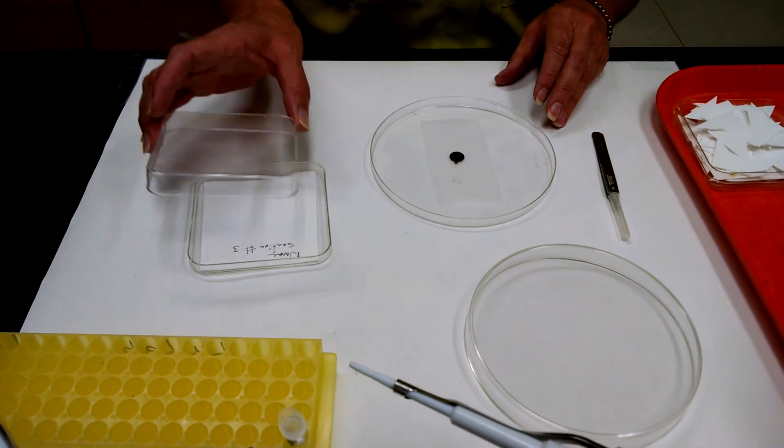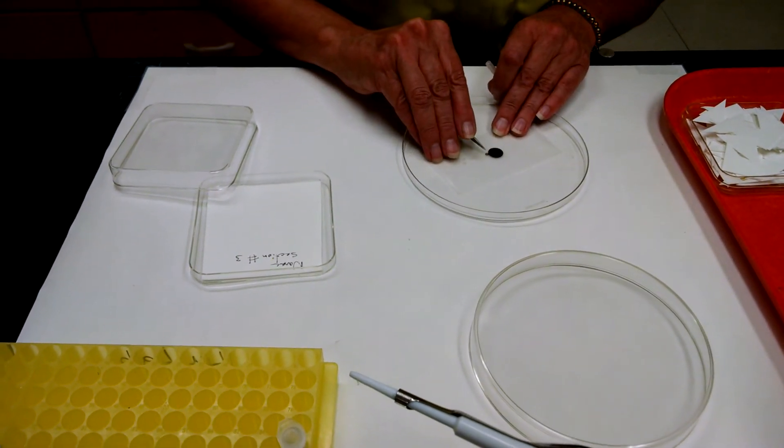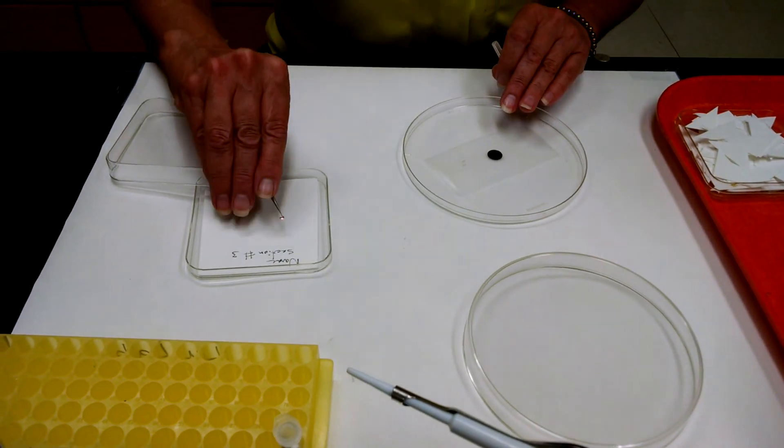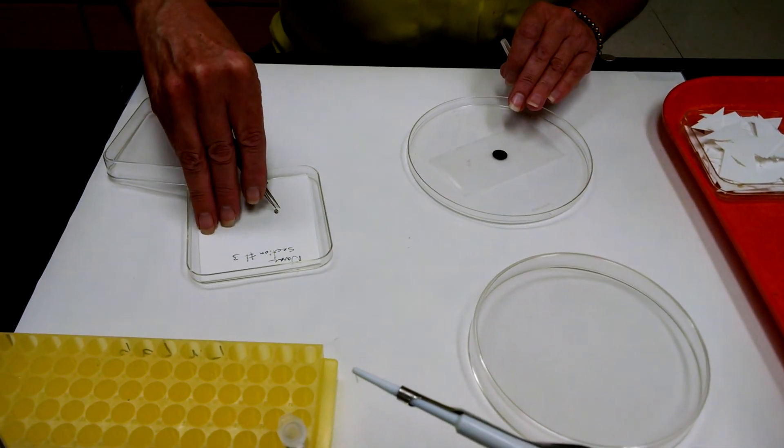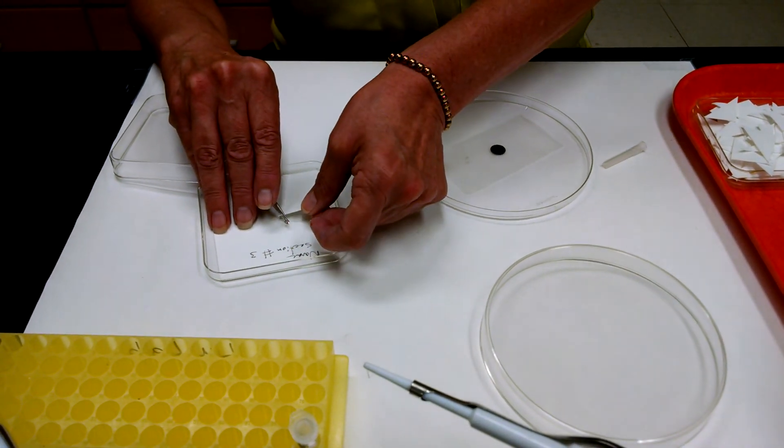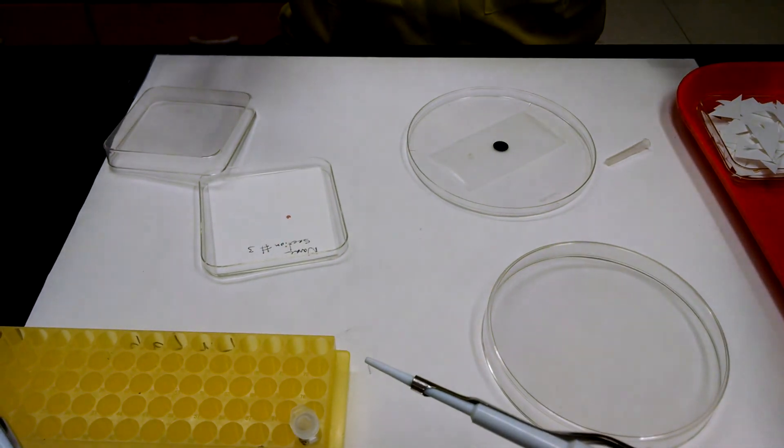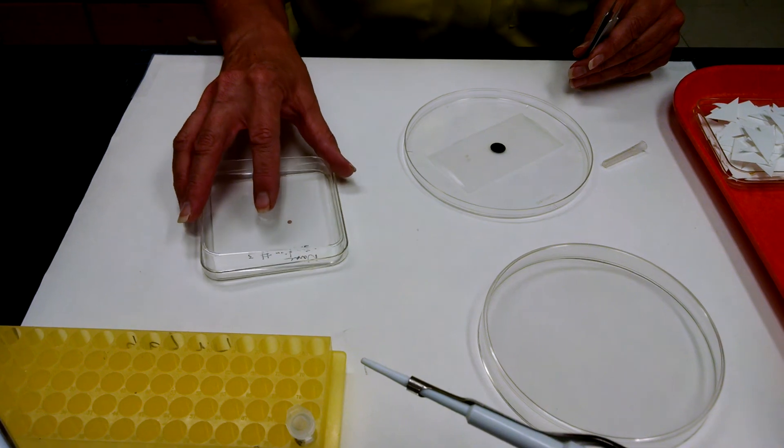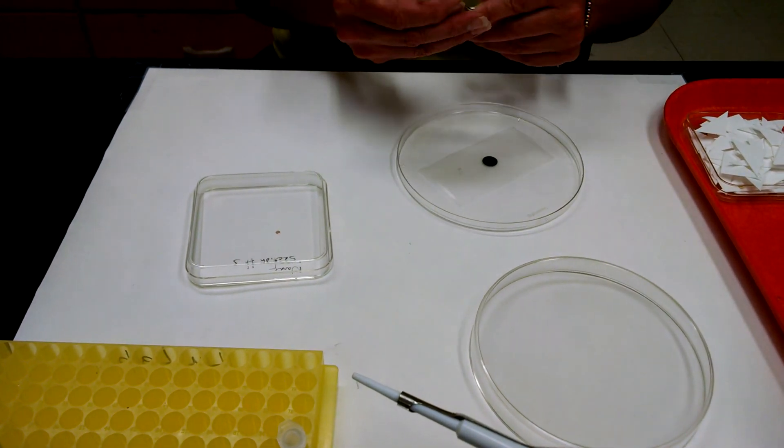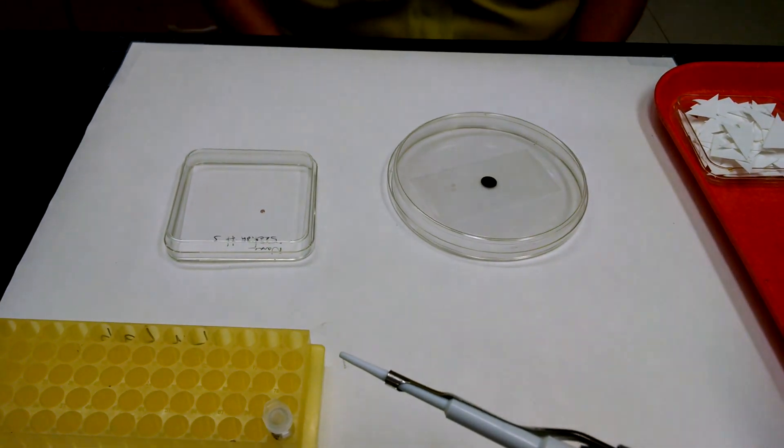So the next thing we're going to do is to gently pick up the grid by the corner by an edge and place it onto the Whatman paper. And sometimes if you get something sticking like this, you can get one of those wicking papers and help it off. Cover it. There will be two grids to a box because you and your partner are going to share a box. And that is negative staining.